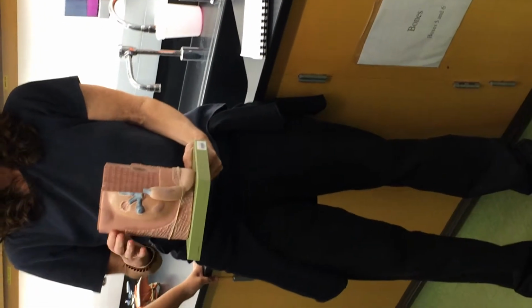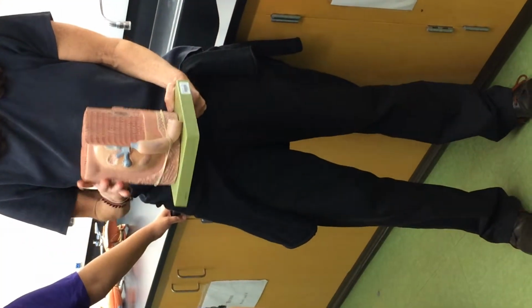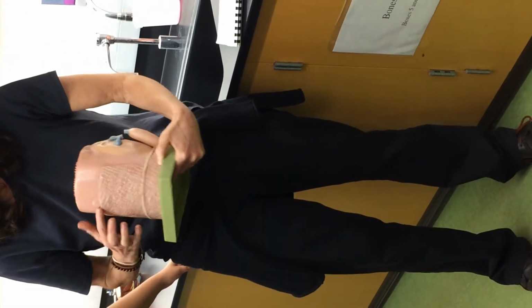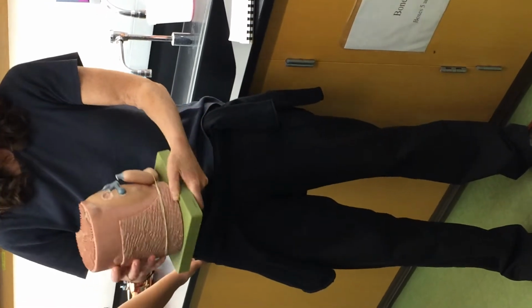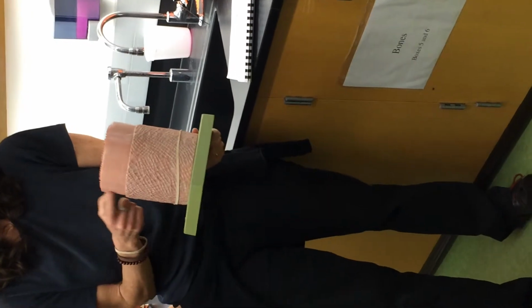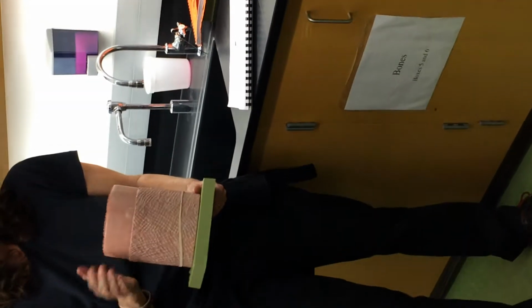Right? Okay. So this is one muscle cell or muscle fiber. It's long, cylindrical, multinucleated. Let's see if we can find two nuclei. There's one. There's another one. Thank you. It's like an Easter egg hunt. And this is the actual sarcolemma. It's not on our list, but that's the layer of the skeletal muscle.